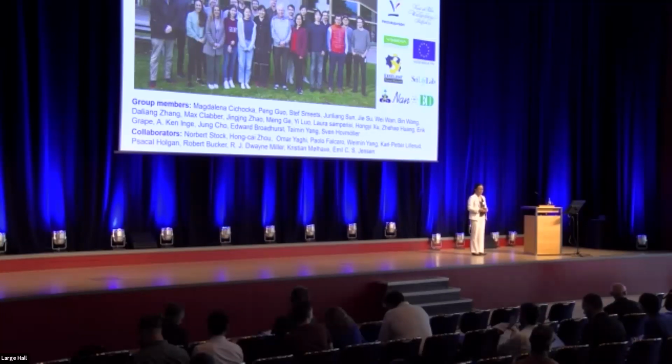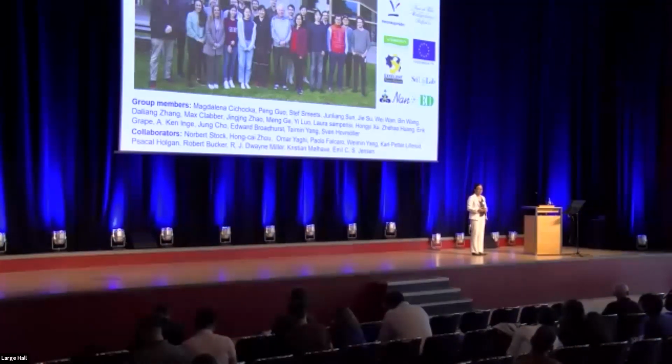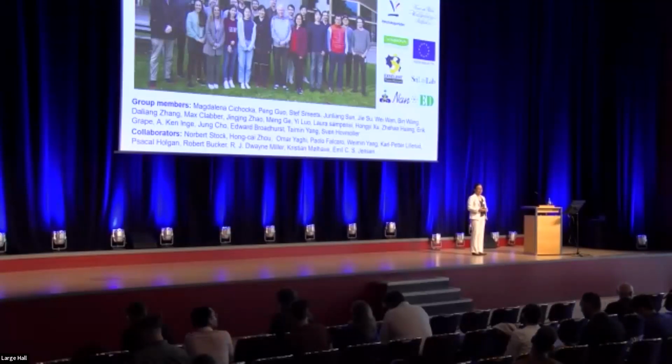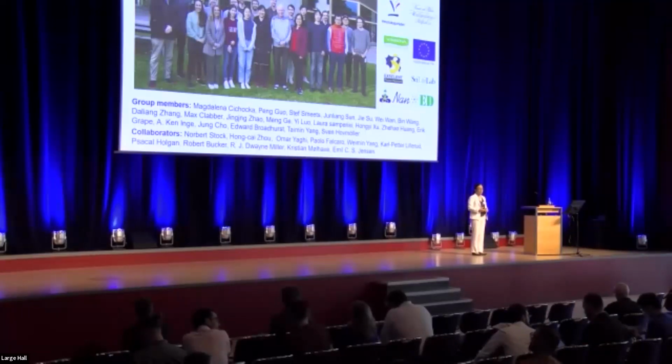Thank you. Second question. Thanks again. Dear Professor Zou, thanks for your lectures. I'm Jianbo Song from the Hanke Group, a PhD student from the Hanke Group in Dortmund, at the last phase of my study. I have listened to your lectures many times, and the technique has now become more advanced and more precise and even faster. I wonder, two questions. First one is, have you ever measured a sample under a cryogenic atmosphere to prevent the sample from beam damage? Yes, and we have done a lot. Okay, cool.